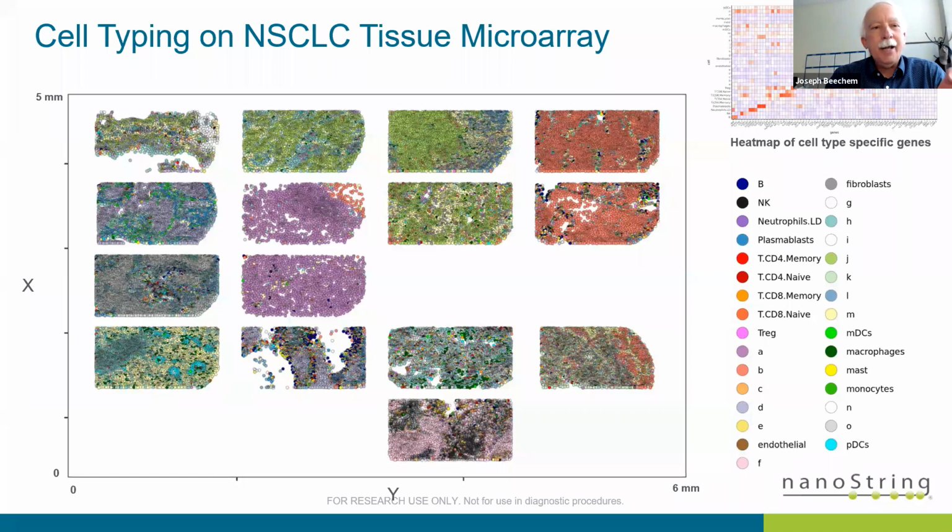Now, if you want to, you can put a bunch of tissues on a single SMI flow cell, and that allows you to get more samples going at a time. This is one we were running the other day. Again, these are non-small cell lung cancer tissue arrays. What are we looking at? 1, 2, 3, 4, 5, 8, 10, 12, 15 different tissue slices at a time, doing all this massive cell identification on all these tissues simultaneously. That definitely helps your throughput.